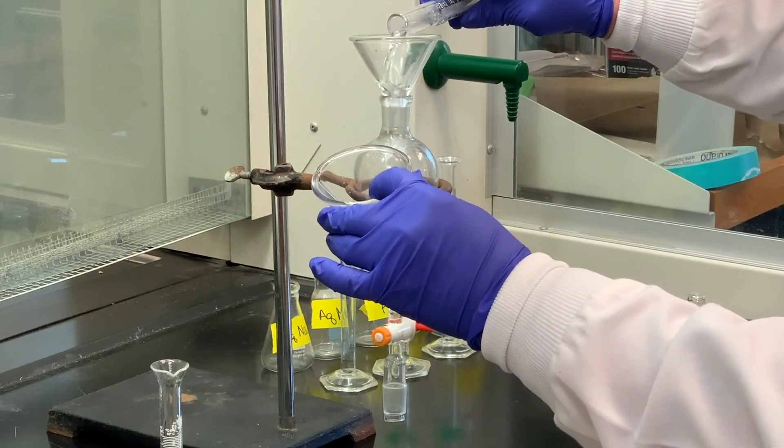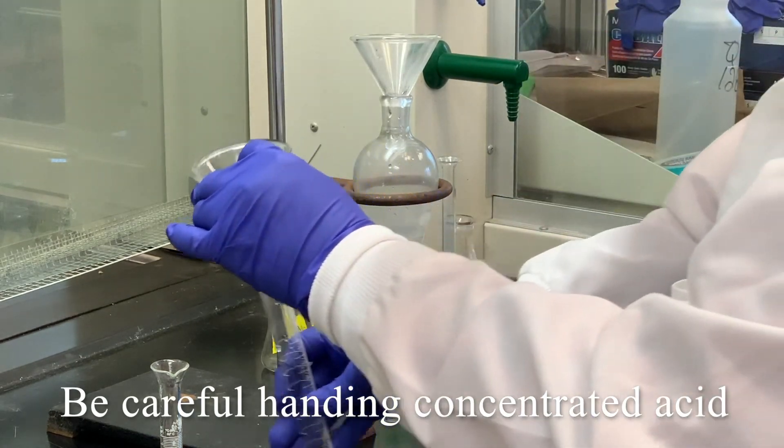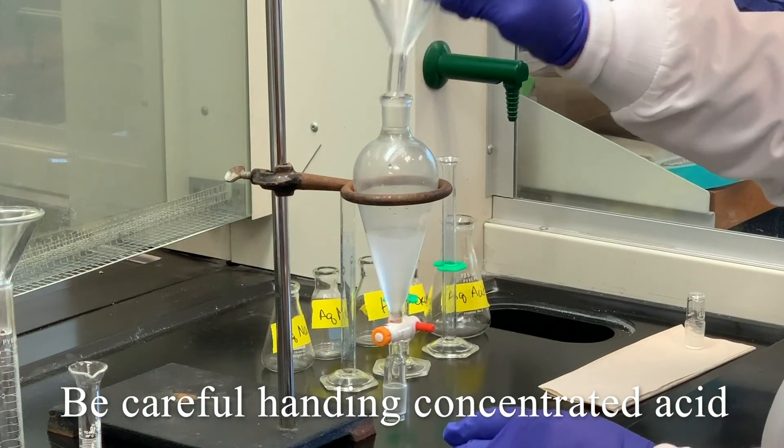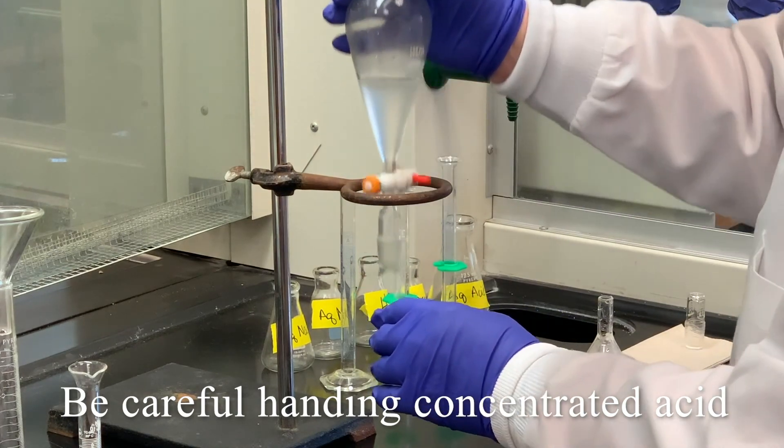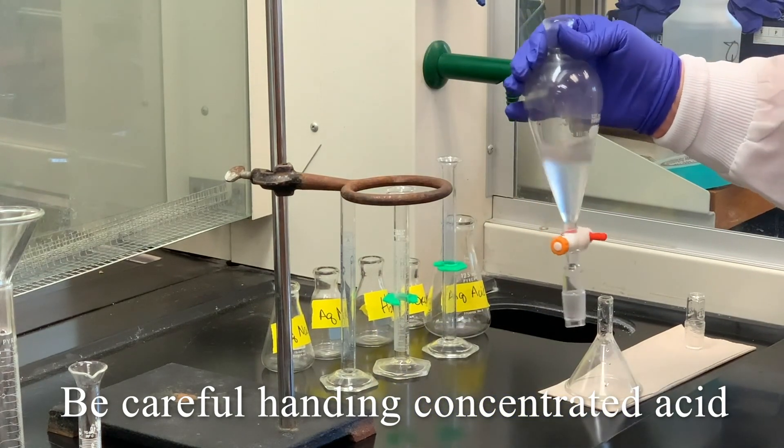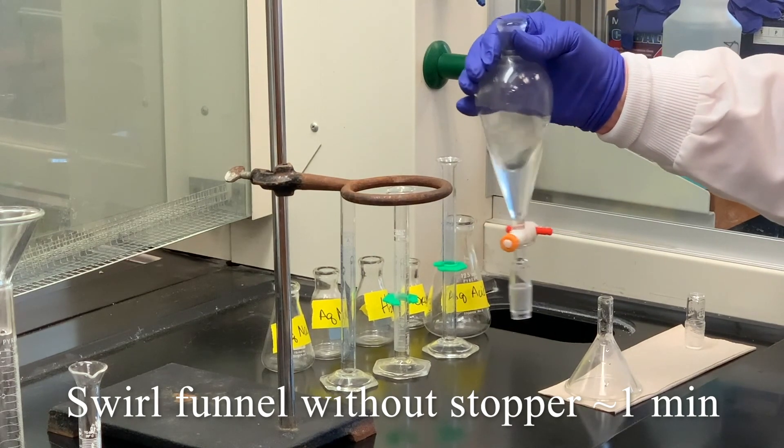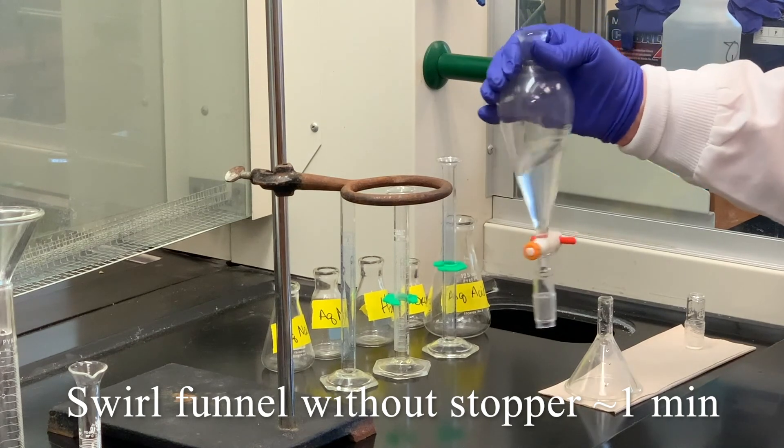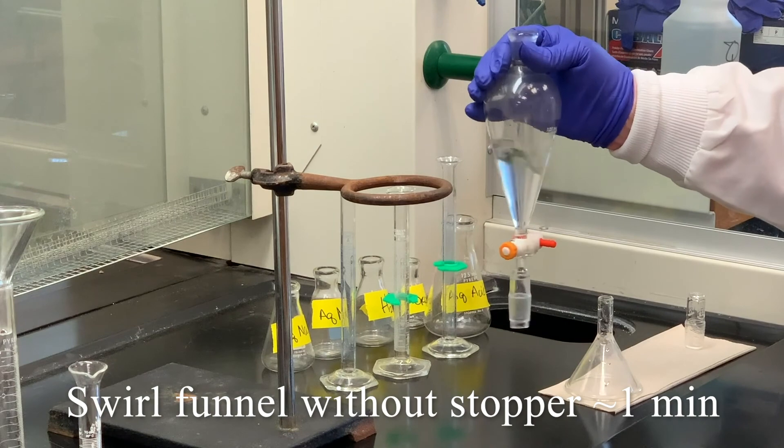And again, be careful with the concentrated hydrochloric acid. And initially, what we want to do is just kind of swirl this without the stopper for about a minute. So I'm just going to kind of swirl it a little bit. And I don't have to worry about venting since it is open to the atmosphere here. So just kind of swirl it for about a minute.